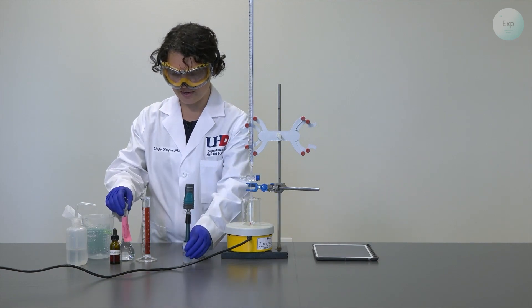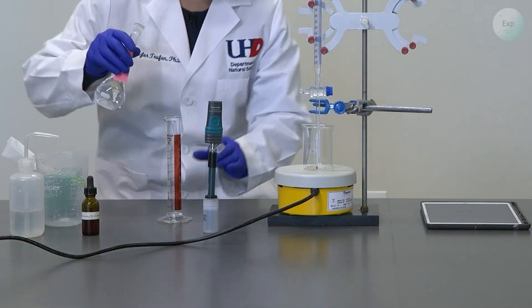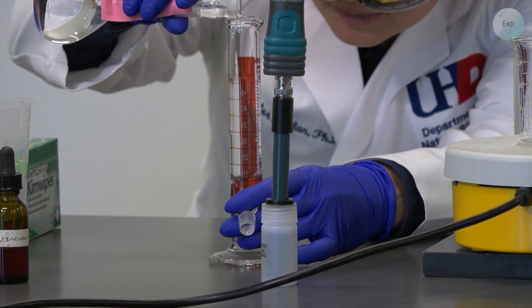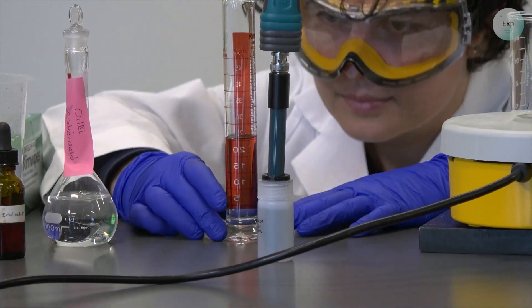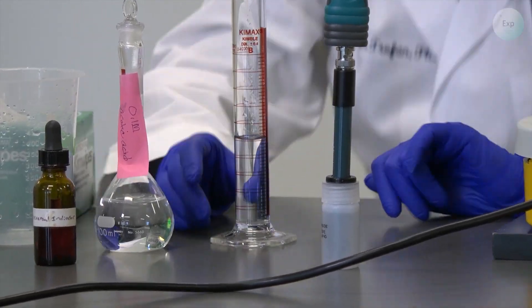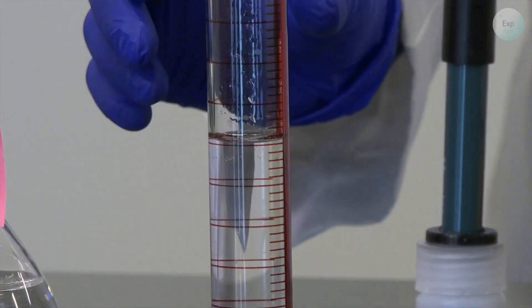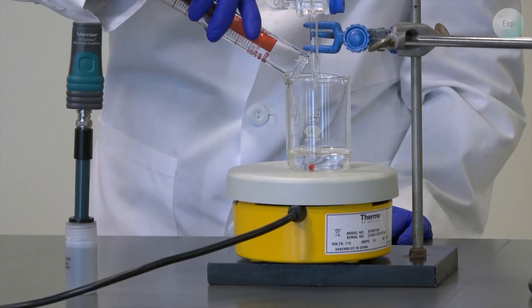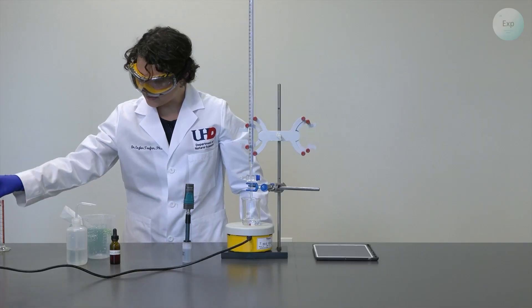The first thing we are going to do is transfer the acetic acid solution inside our beaker. I will measure out approximately 25 milliliters — I have 25.6 milliliters of the approximately 0.1 molar acetic acid solution. I will transfer this into my beaker without spilling it, and with that I am done with my acetic acid solution.